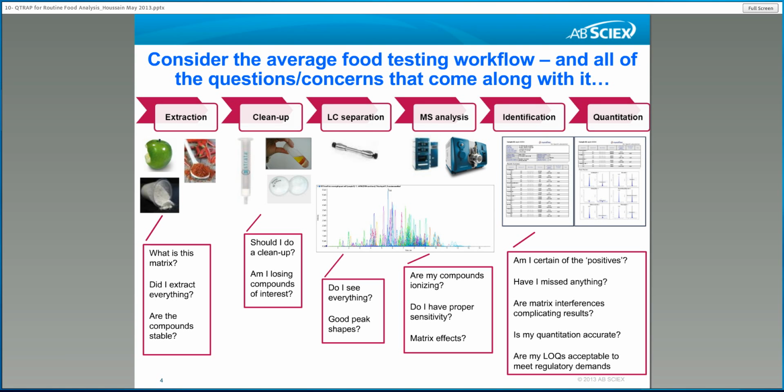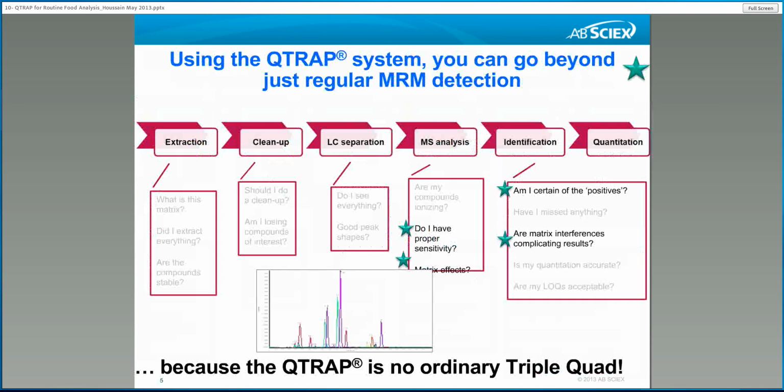When it comes to data processing, labs always want to be sure that their results are accurate, and they have a good limit of quantification to meet any regulatory demands. All these questions you see here in this slide need to have answers to ensure accuracy of the result.